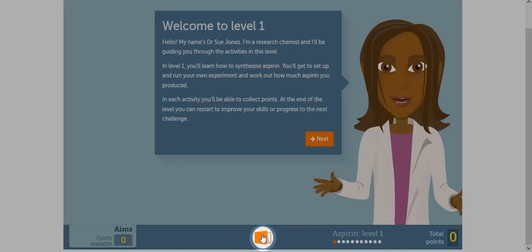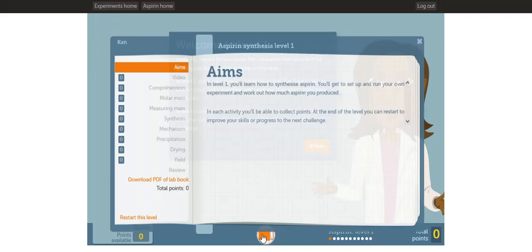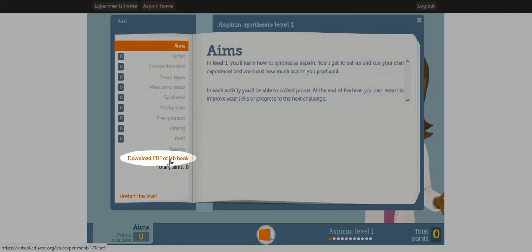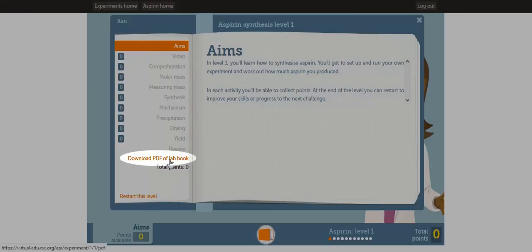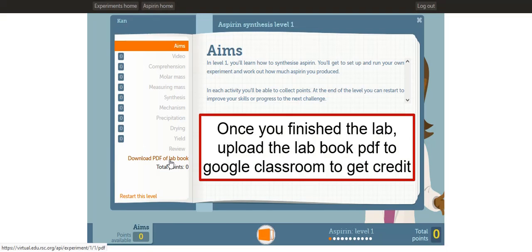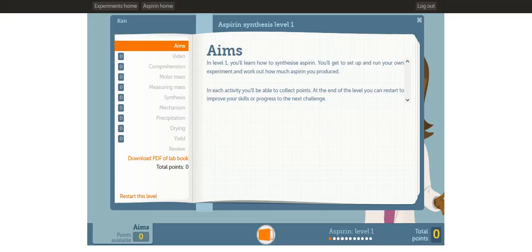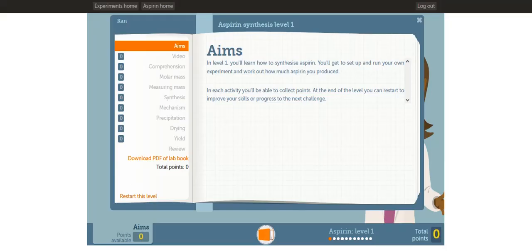In the middle, on the bottom of the screen, is the lab book. Click the button. This lab book will record everything you have done in this virtual lab and summarize it for you. Once you've completed this virtual lab, click Download to download a PDF of this lab book. This PDF is what you'll be uploading onto Google Classroom. If you wish to restart the level or the lab, click Restart. If you wish to close the lab book, click the X button on top.